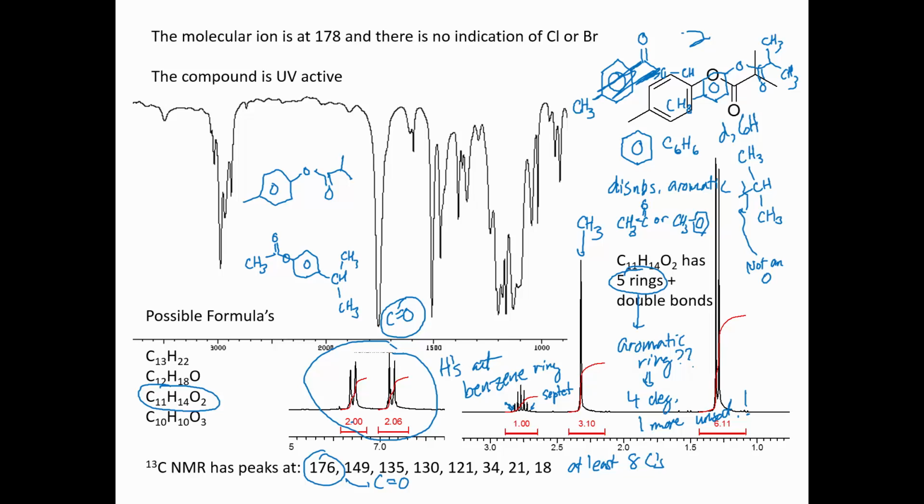Okay, and this illustrates something I said previously, that when we get to the actual chapters that deal with different types of C double bond O's, we'll be able to distinguish these two structures. An ester would look a little bit different from a ketone. Actually, neither of these is a ketone, but we would be able to easily distinguish these two compounds. Actually, no. When I think about it, I think this is just as good a structure as the other one.